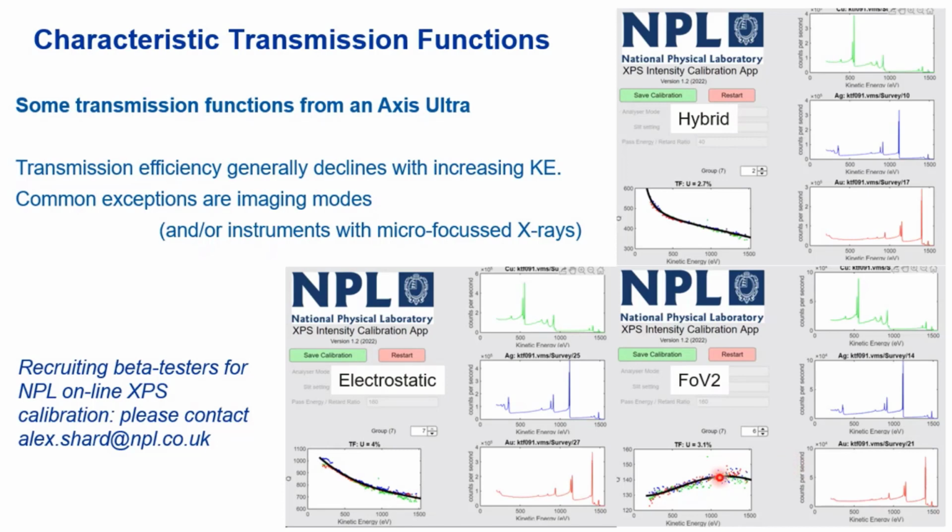So it should be the same efficiency across the board. That doesn't mean to say that your detector is constantly efficient from one side of the detector to the other. That's something you need to work out. But at least the transmission is constant. But it has to be well set up. Sometimes it isn't, or it drifts.